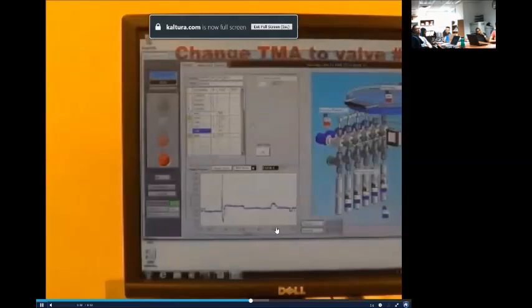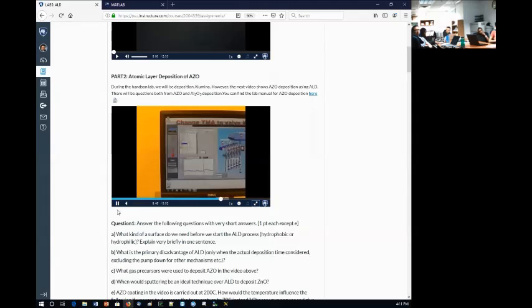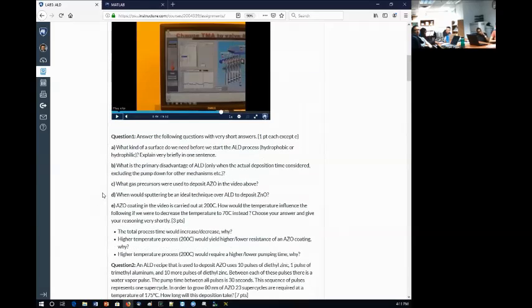That's the important thing. You start to see these peaks. I hope you can see them. They will show you how the ALD is carrying out the whole process. It's sending one precursor, and then purging it, and then sending the next precursor, following these peaks. I think this video will clearly show you what I mean by this whole presentation that I did before.